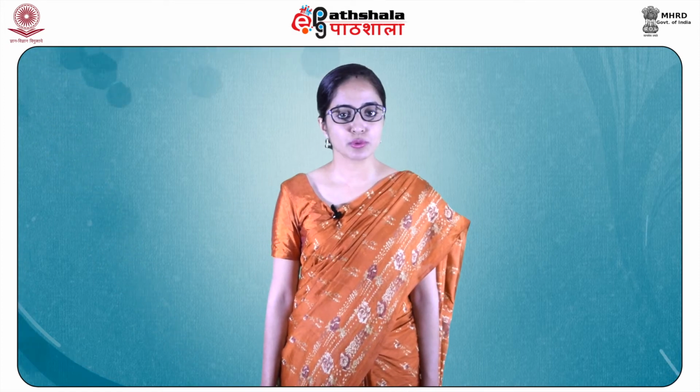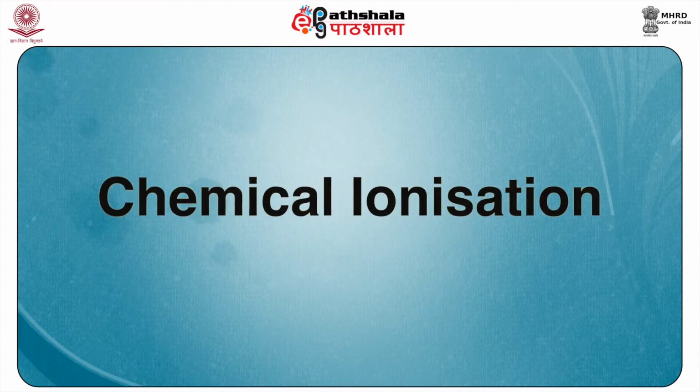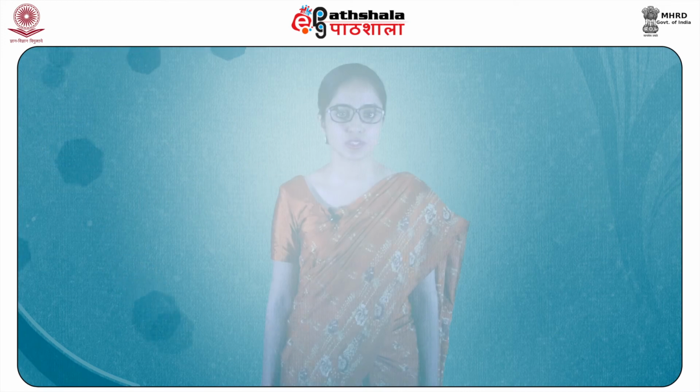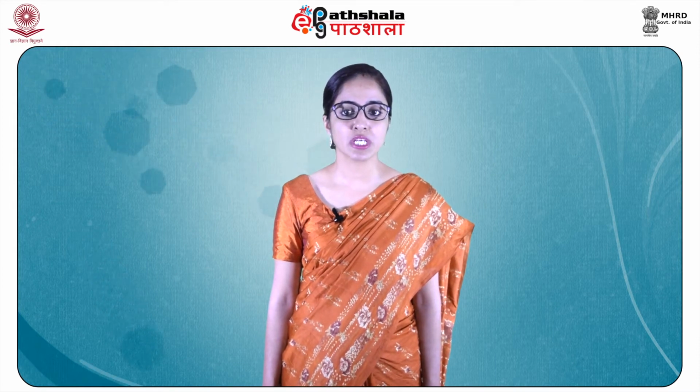Now, let us come on to the second way of ionization in mass spectrometers, which is called chemical ionization. Students, in chemical ionization, the sample molecules are combined with a stream of ionized reagent gas that is present in great excess relative to the sample.